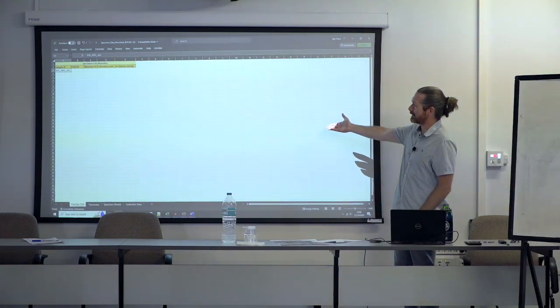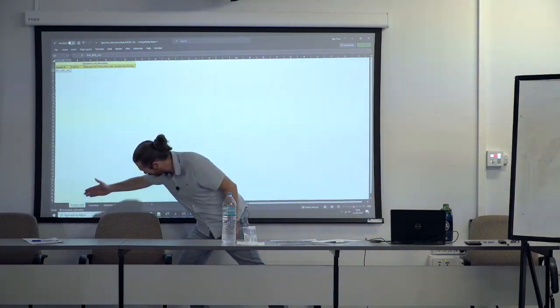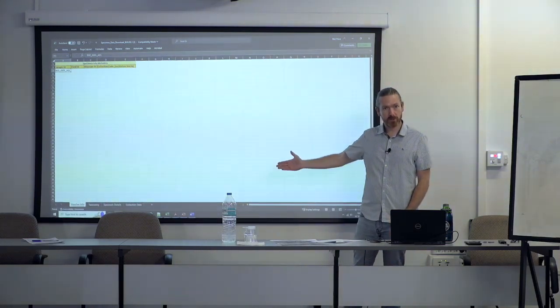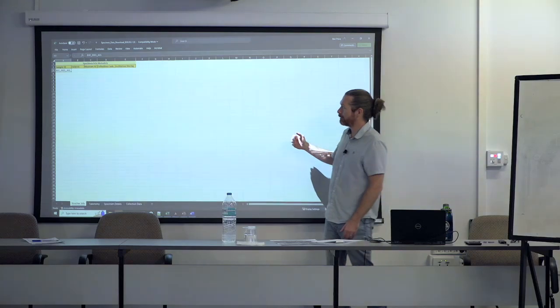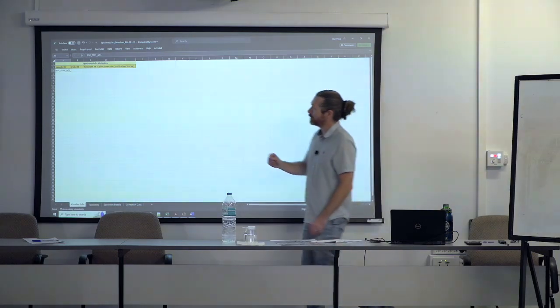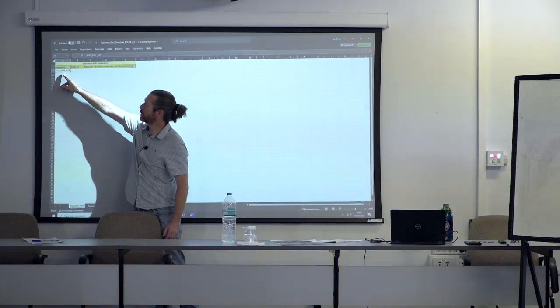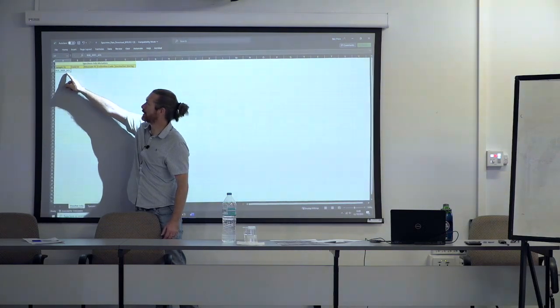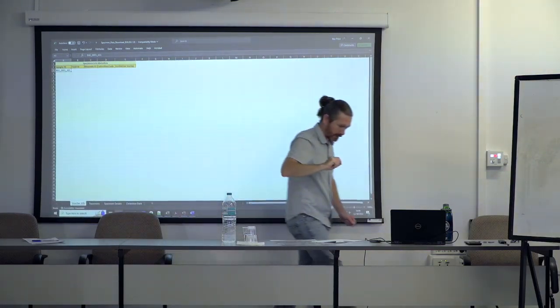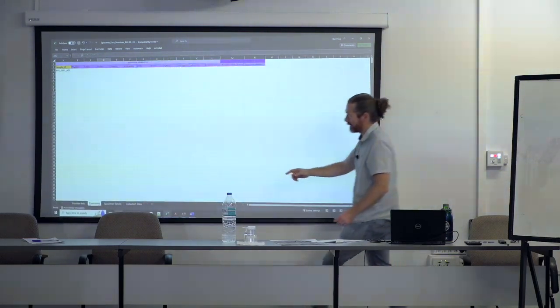So when you download the spreadsheet, it looks like this. It is currently a tabbed format, so there are tabs here for voucher info, taxonomy, specimen details, and collection data. I'm told at some point it will go to a single spreadsheet format, which is great. And one key thing they've updated quite recently is if you type in a sample ID here, this is the format we're using for BGE, BGE underscore the plate number, so 0001 underscore A01. So that is a caddisfly from the Natural History Museum that was sampled recently. When you type that in, it will now automatically populate that number in all the other tabs.